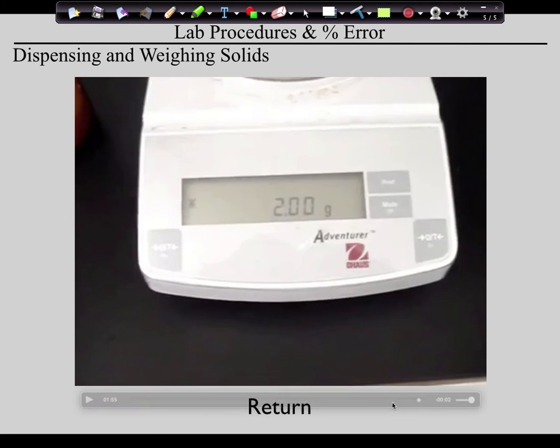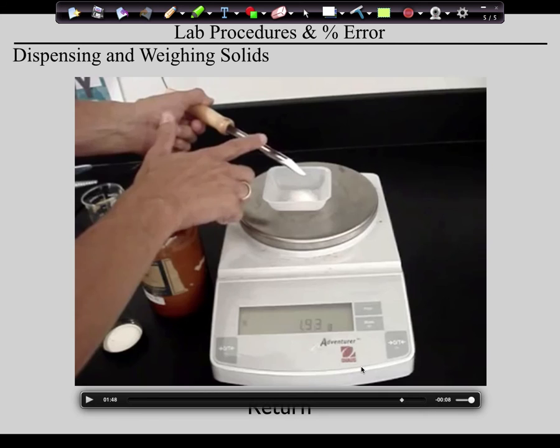Now, guys, this is the idea. Once you got to 2 grams, let's talk about what you can do with this. So what is he going to end up doing with this sugar that's in the spoon, the stuff that's left? That can go back. Why is it that it's okay to put that back? Well, we've already stuck this spatula into the jar. So if the spatula is contaminated, are you okay?